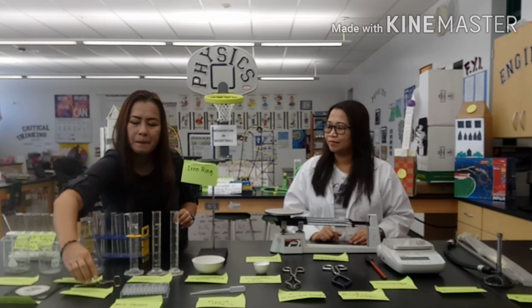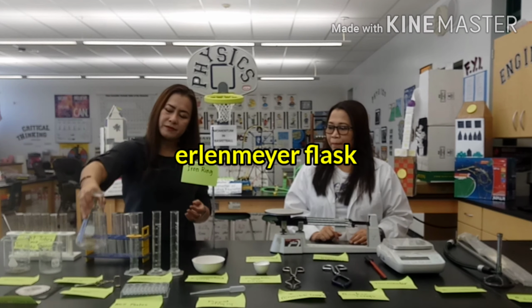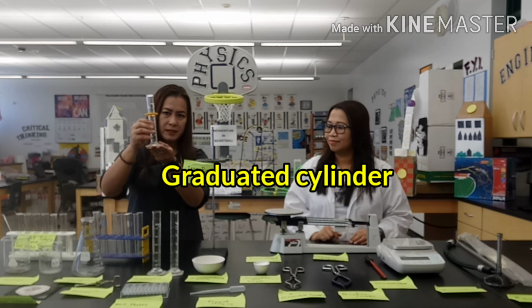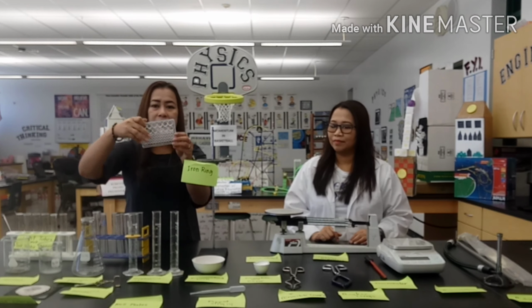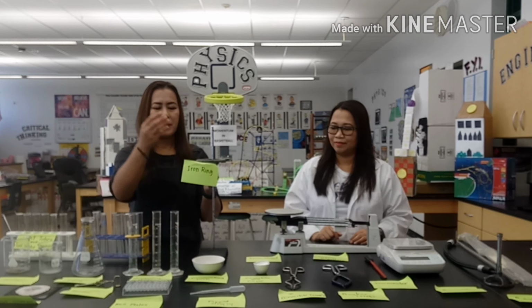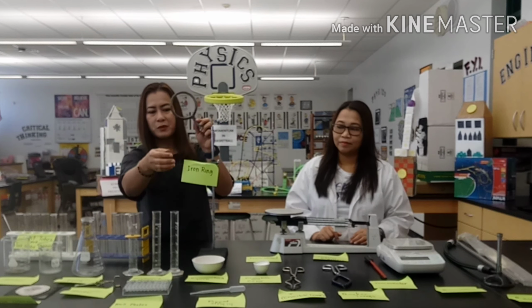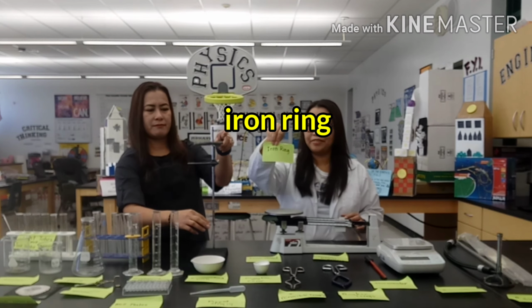Yes. We have here a bigger Erlenmeyer flask. The graduated cylinders. Here. This one is the well plate. We have the iron stand, and of course this one, which is attached to the iron stand, we call the iron ring.